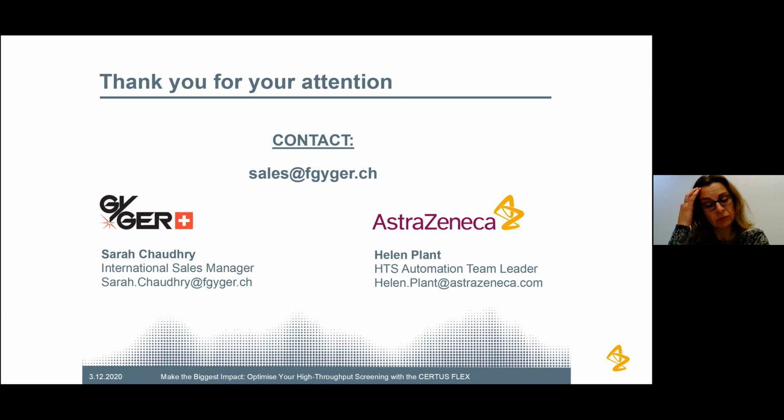We also have another question from Karen at PPSC. Helen, do you clean your tubings or only the valves with the Vici valves? That's a good question. The Vici valves only clean through the head. We are aware that the leg, the bit from the bottle to the head itself, will still have reagent. So the users, when they come in the morning, are aware that they have to flush that through with water before they start loading on new reagents. We'd love the CERTUS to be able to empty back, but obviously that's not an option at the moment.